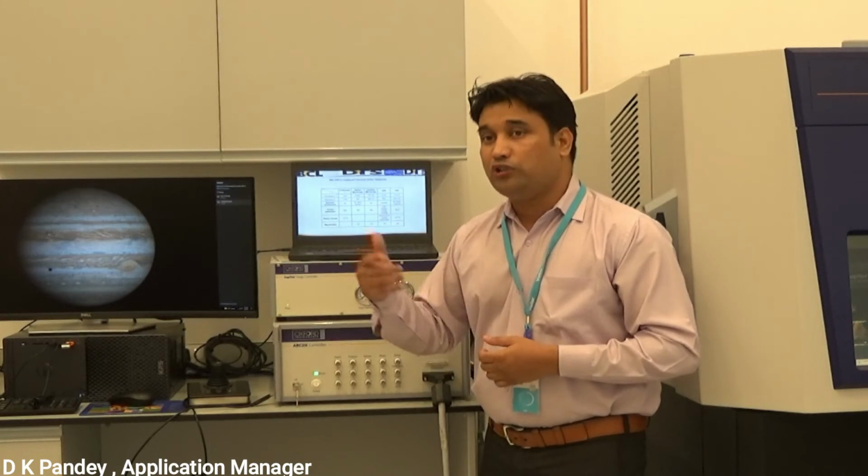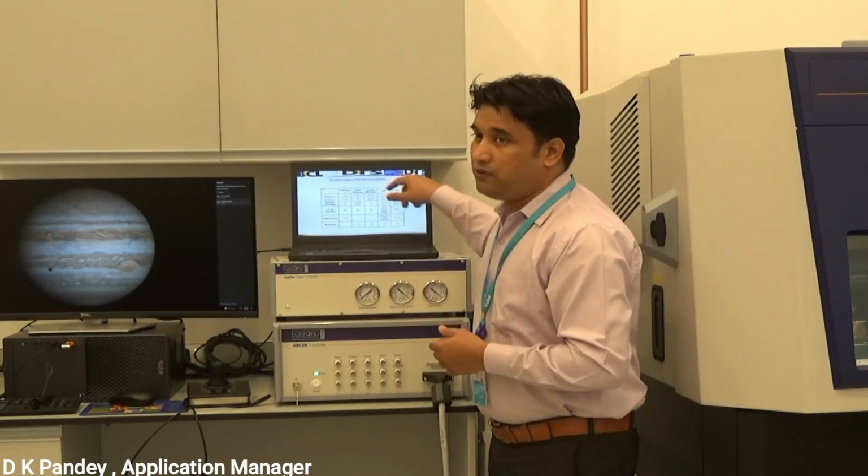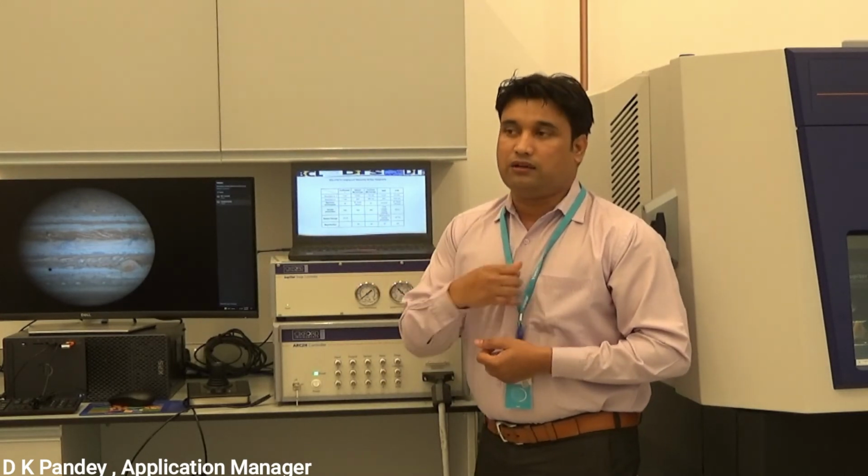0.1 nanometer, up to the atomic resolution, also the size of atoms. So that is the beauty of AFM, which other equipment cannot do very easily. That's why it is still in the market, the AFM.